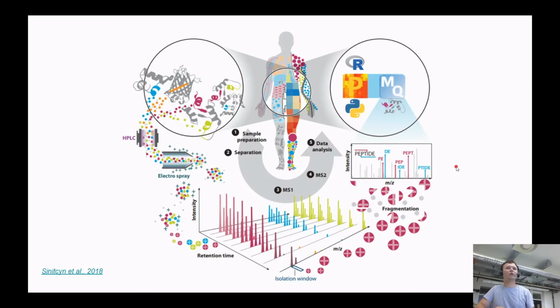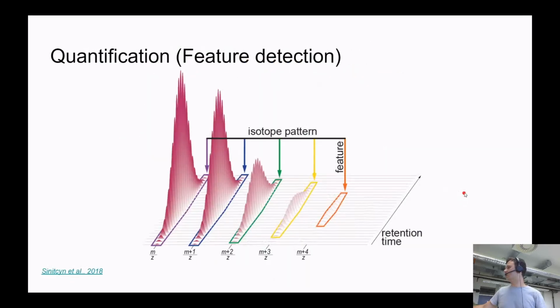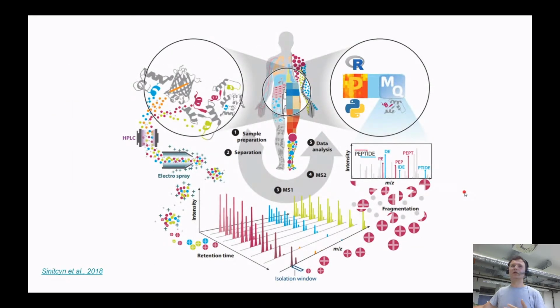You have to keep in mind that we are not getting just one molecule of the peptide. We are getting millions of peptides, and this fragmentation is happening simultaneously. You may call this a stochastic process, a rather probabilistic process. But it's not like there aren't peptides prone to break in certain locations. Let's say there are some amino acids after which breakage never happens. The truth is that in our lab, we constructed a machine learning algorithm which actually solved this issue well. It can really predict where the fragmentation happens and how intense it is.